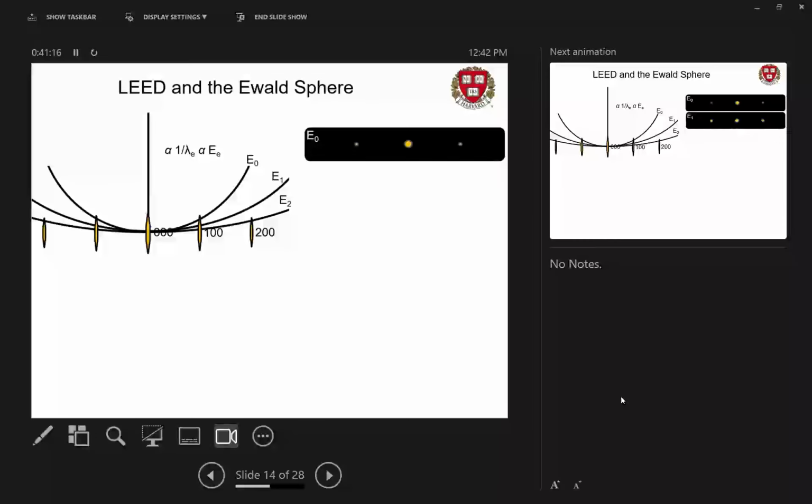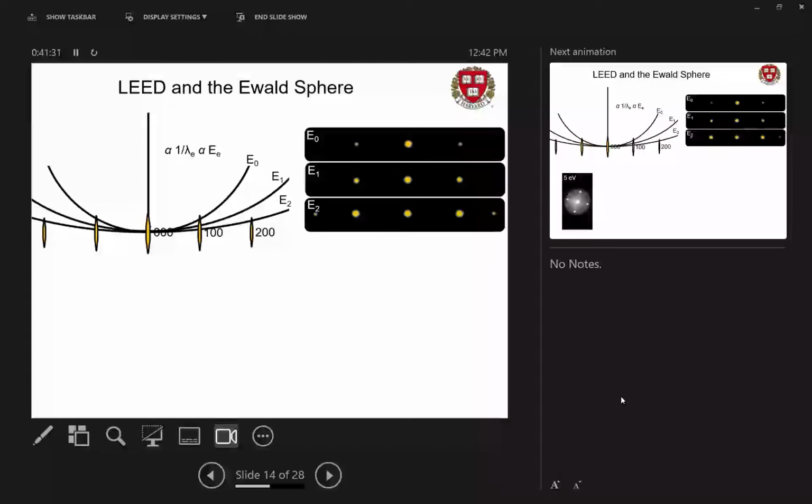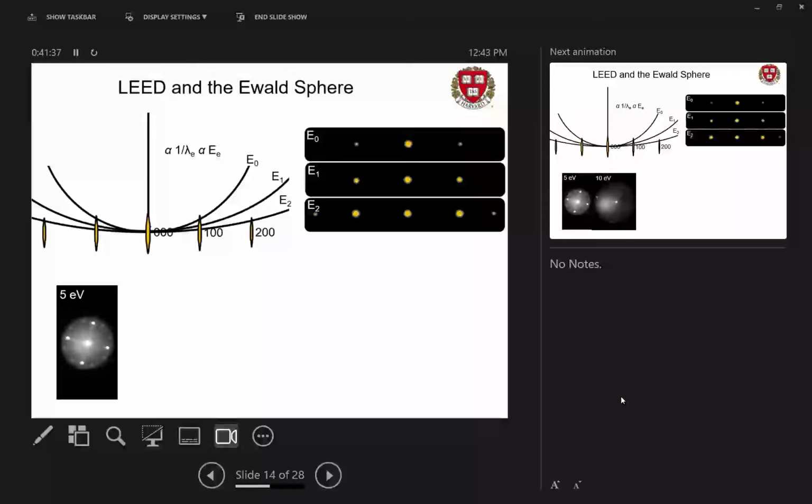So I've drawn a quick schematic. If we're on the E0 arc, we'll get the center spot and two beside it. E1 arc, we're still getting the center and two beside, but now we've moved into the thicker part, so the spots are brighter. We go to E2 arc, we start to pick up some extra reflections. That's neat. But again, you never see this in normal electron microscopy or X-ray diffraction because you're never messing around with your radiation's wavelength. But in LEEM, we can do it all we want.